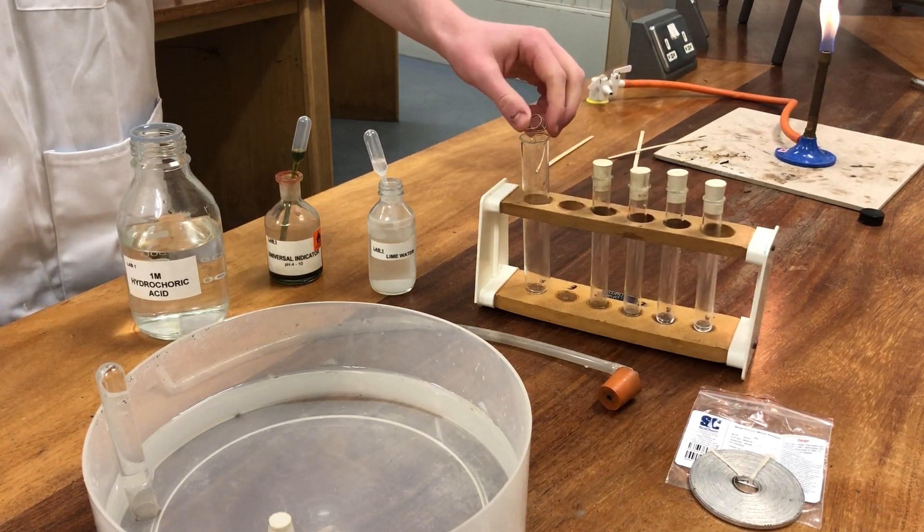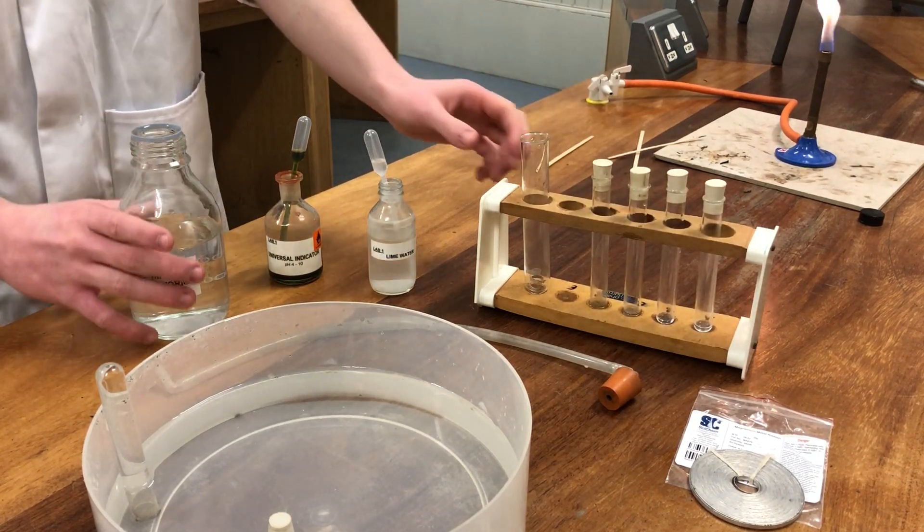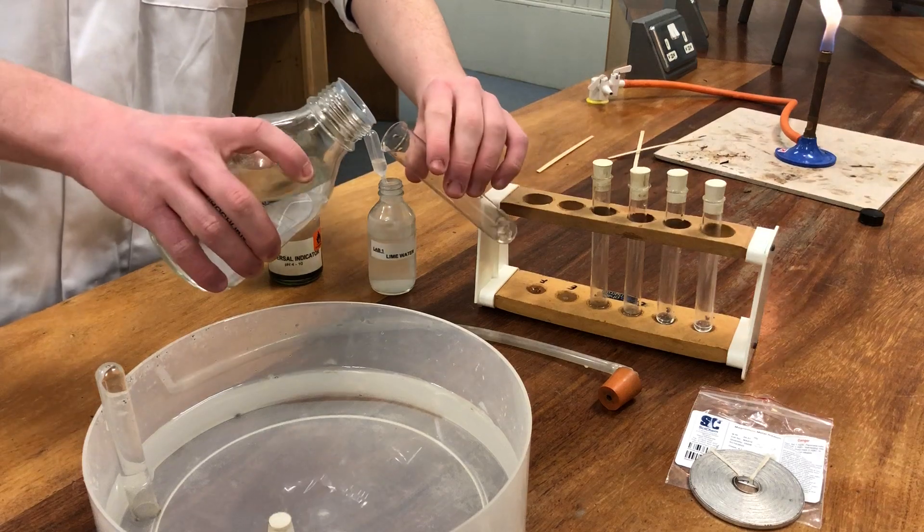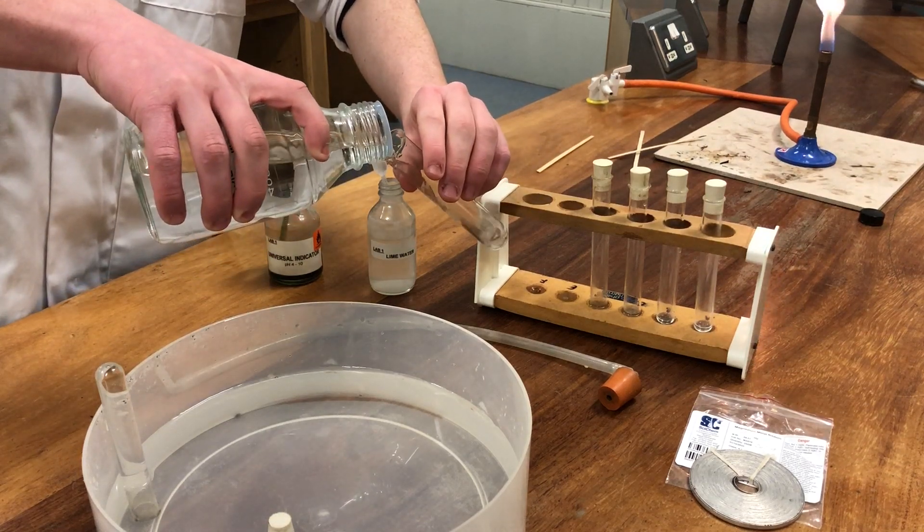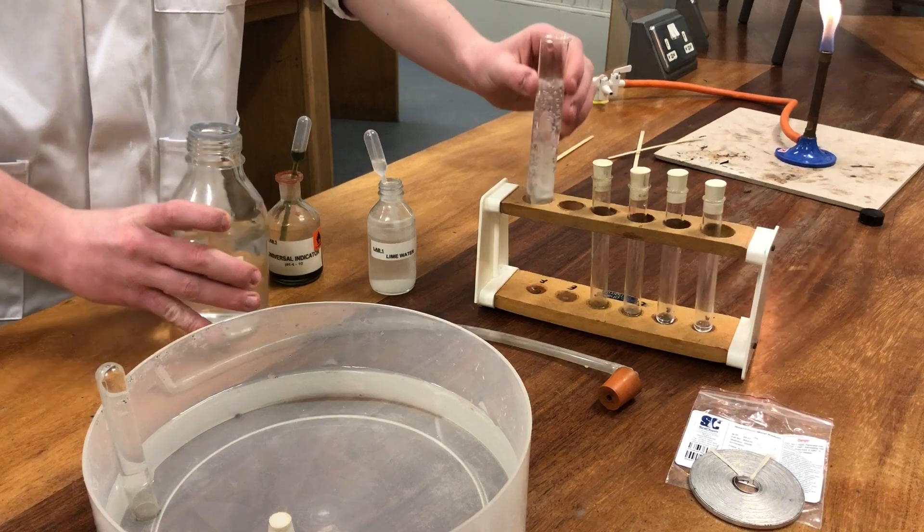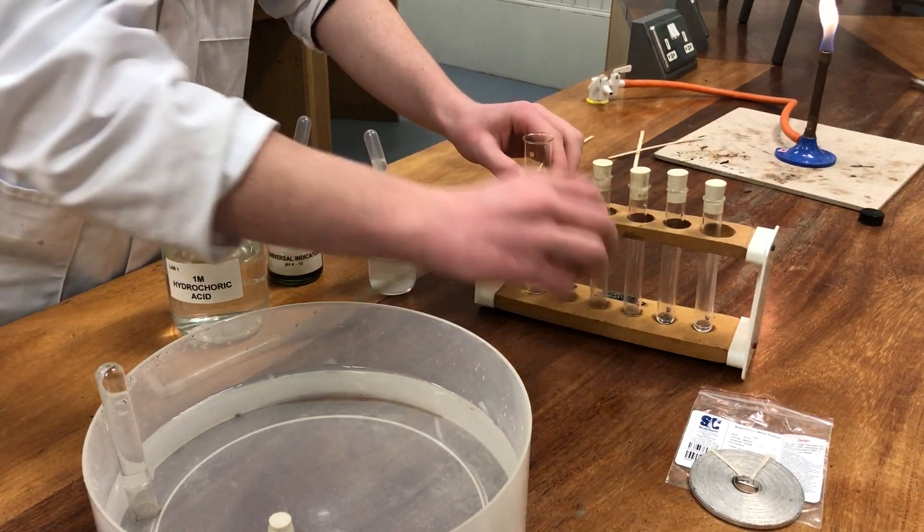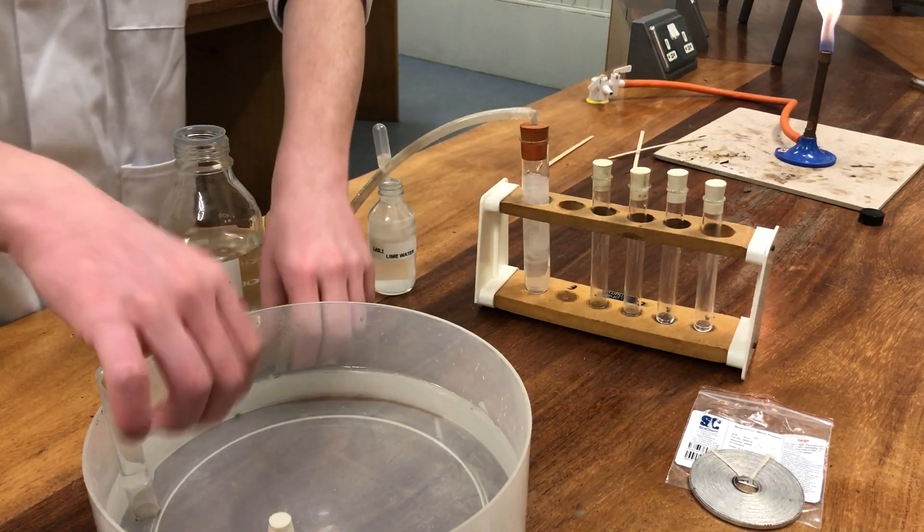Magnesium comes as a ribbon and it's easily cut and easily twisted into a little twirl there, reacting very rapidly with the hydrochloric acid.